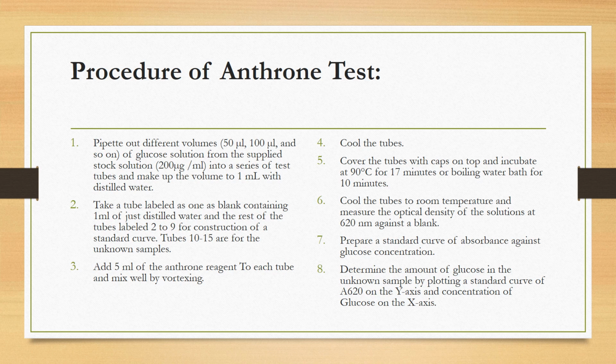After this, you have a positive result for the test in the tubes labeled from 2 to 9, which hold the known concentrations of glucose.